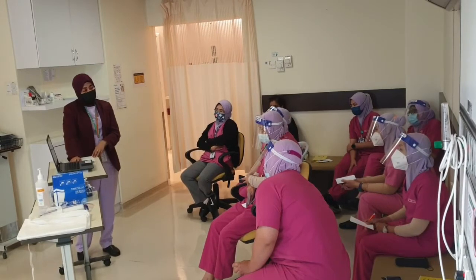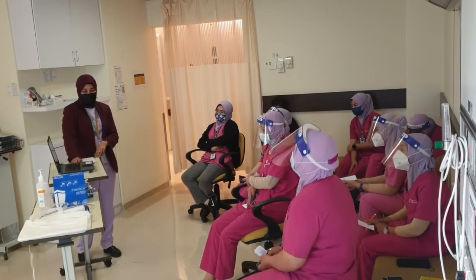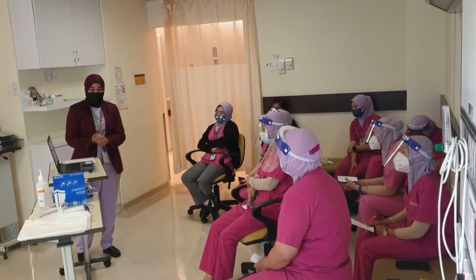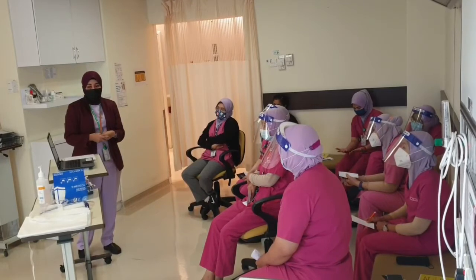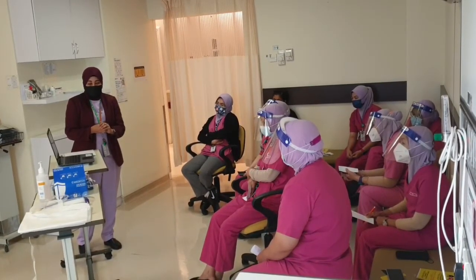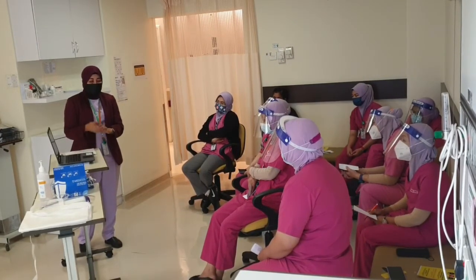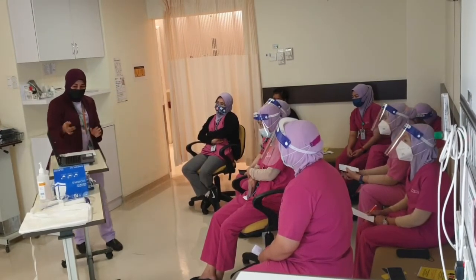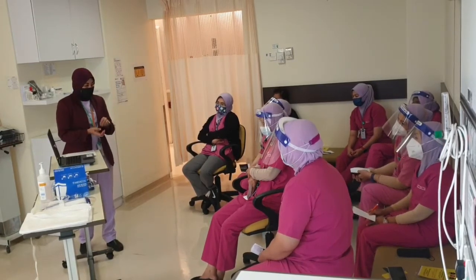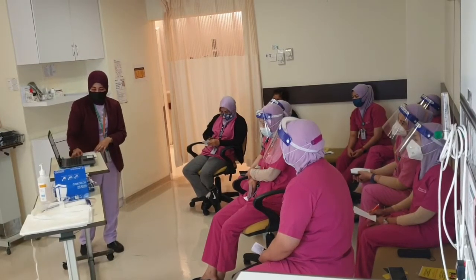So now I will teach you about the proper donning of PPE. First, you need to keep hands away from the face, limit surface touch, change gloves when torn or heavily contaminated, and work from clean to dirty. First, you need hand hygiene. We have steps for the hand hygiene. I will demo it after this.